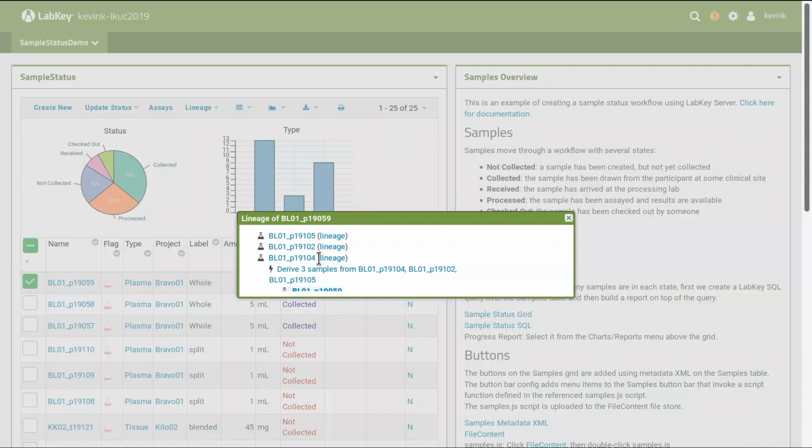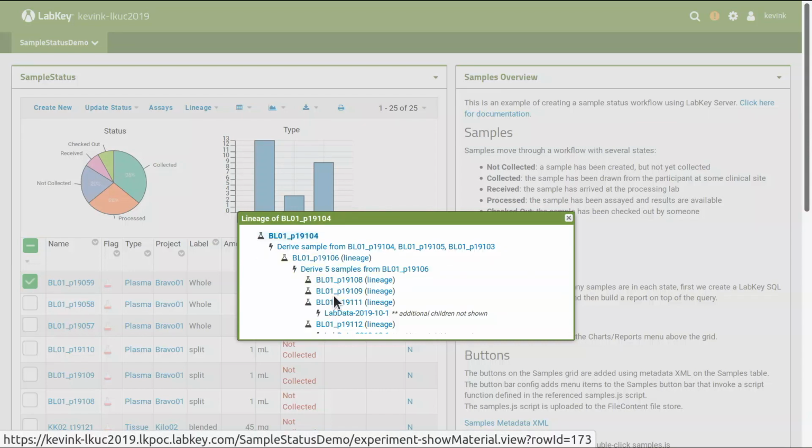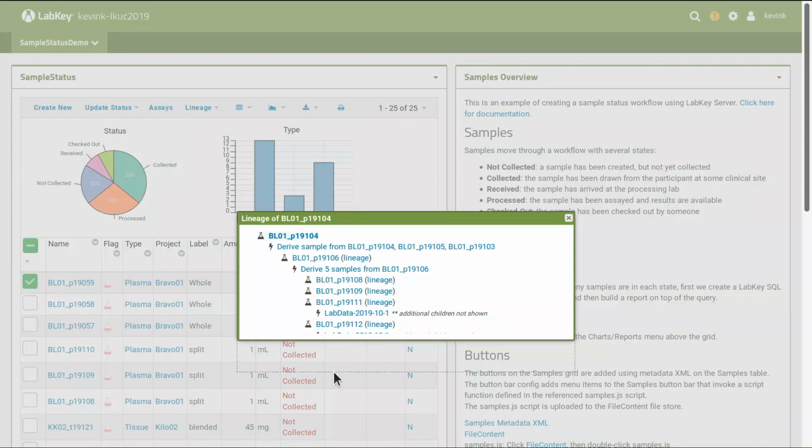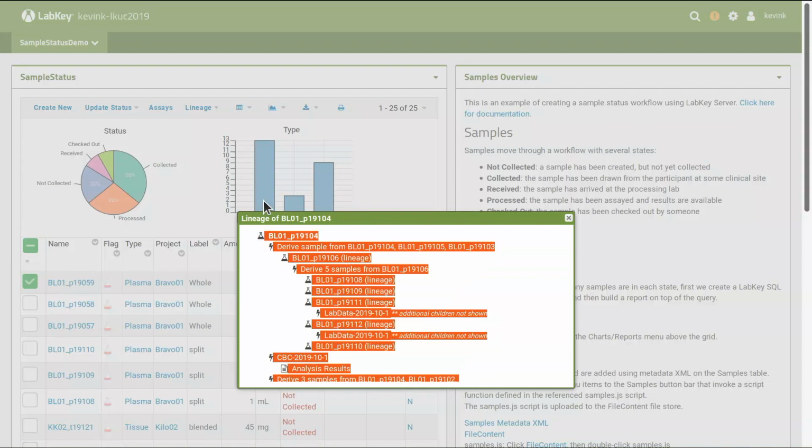This is just HTML that I splatted together. I ran into a lot of encoding issues with HTML while doing this, so I don't recommend this approach, but it got the job done for this. So then I can look at the lineage of my sample, and I can also traverse that. I'll make an additional request and traverse that lineage, and you can see this is just a little toy app. I'm not really doing a lot of processing on the lineage that comes back. I'm just rendering a little tree view, or unordered elements of these things.